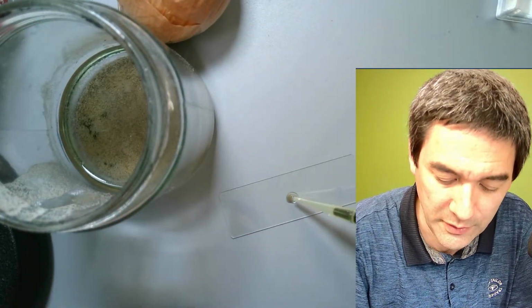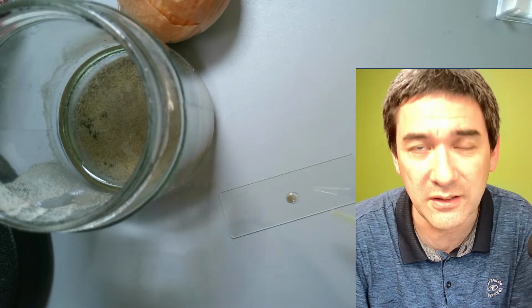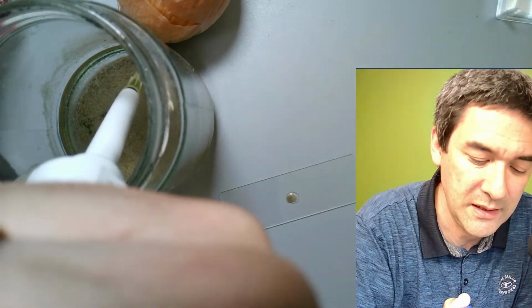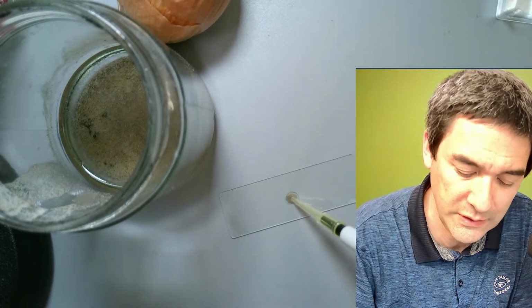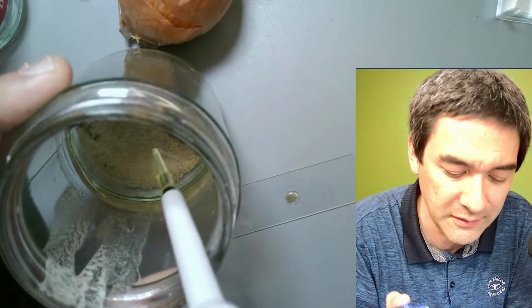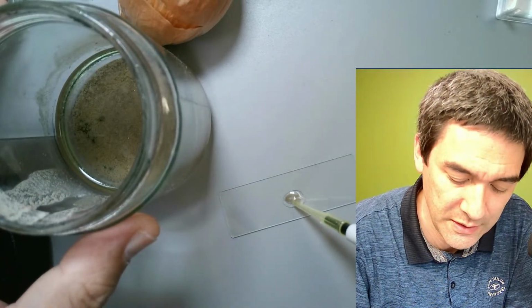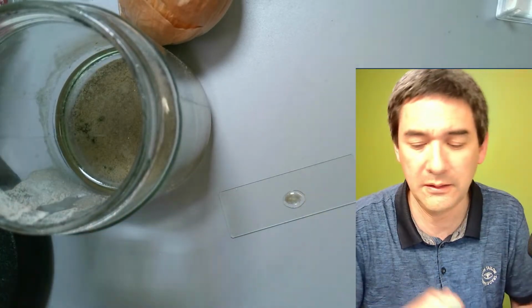The only problem with those sand samples is that because they're fairly thick, the cover glass is not really able to properly press everything flat. So we're gonna spread it a little bit, and let's give it a try.